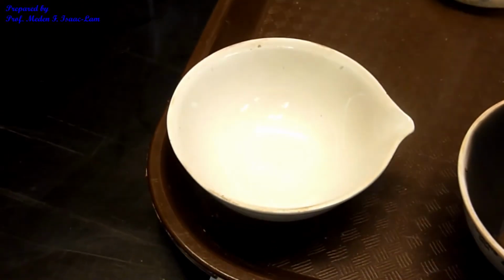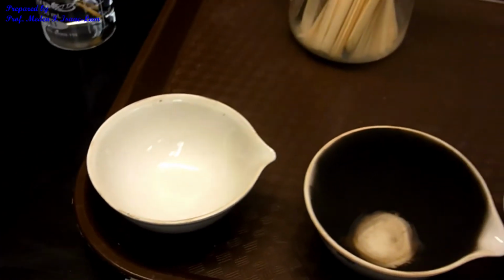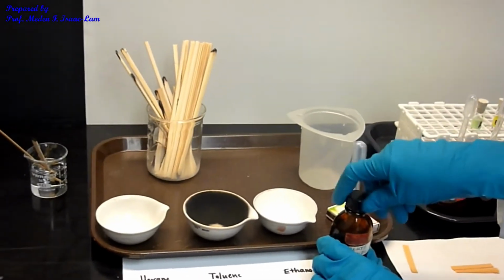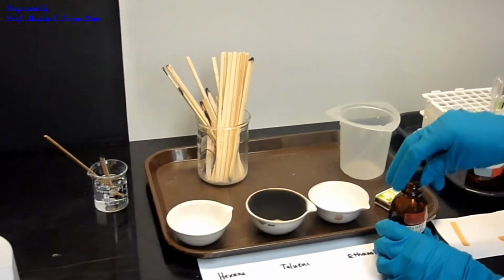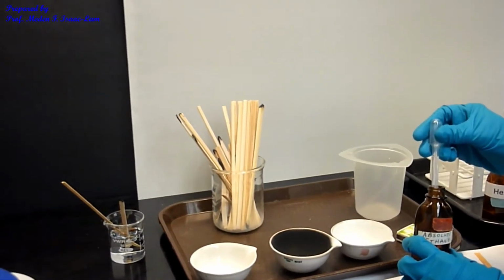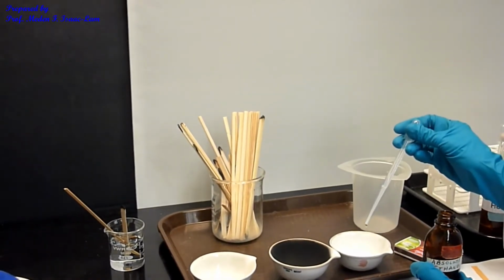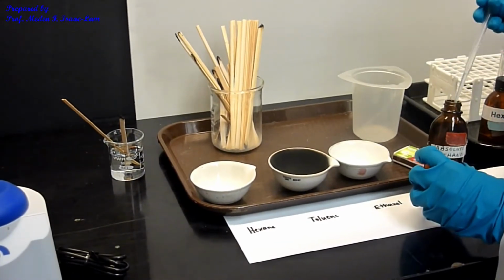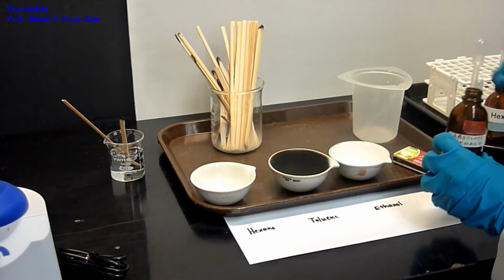Well, we have to clean it up. Okay. So now the next sample is ethanol. So ethanol is now, again, the same idea, 8 drops. 1, 2, 3, 4, 5, 6, 7, 8. So write down the observations, all right?